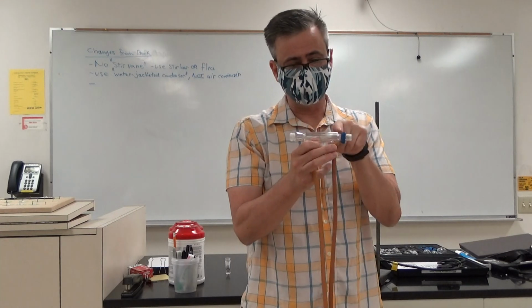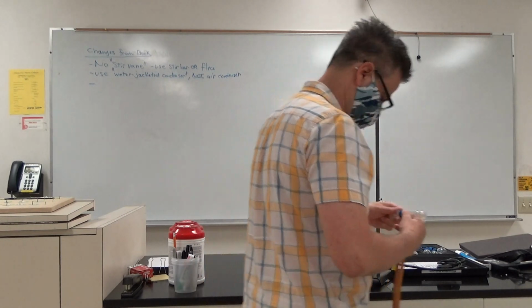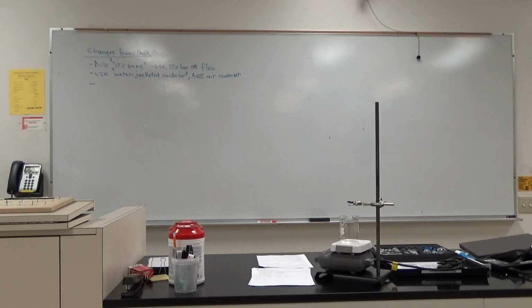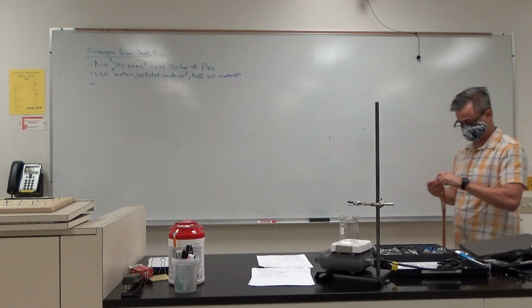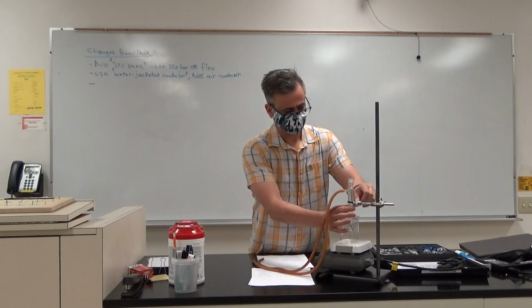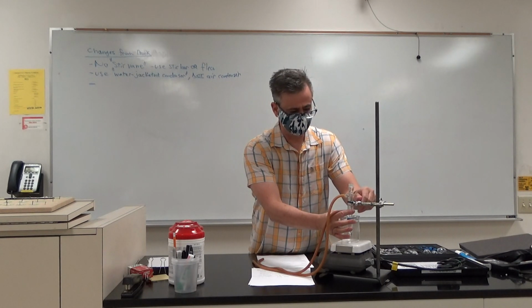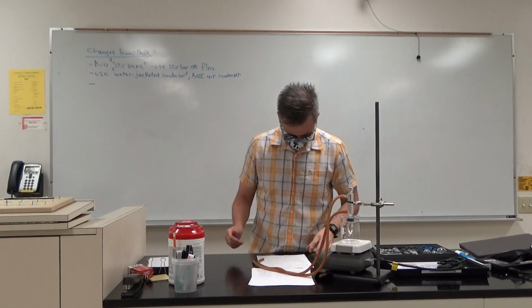But the water we're running through here is totally encased in this jacket and will never be exposed to the reaction. Makes sense? All right. Suspend it like that. Stirring, etc., etc. Okay.